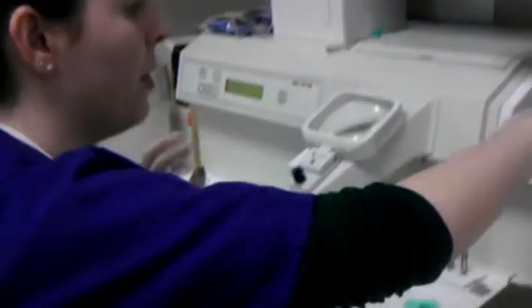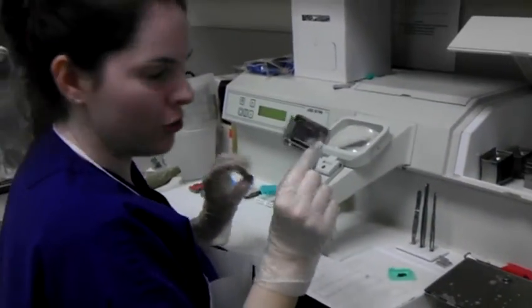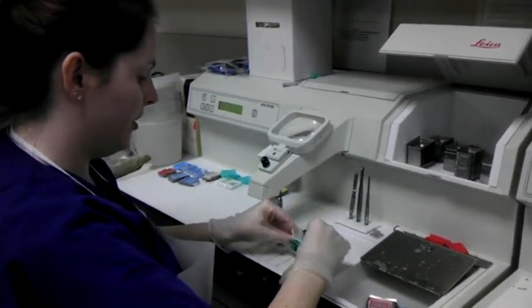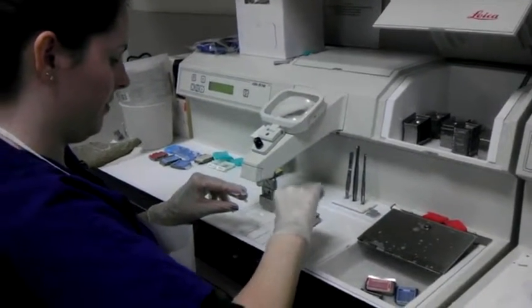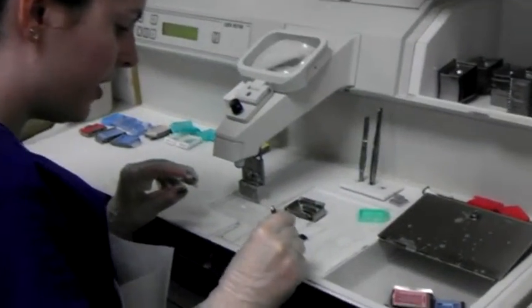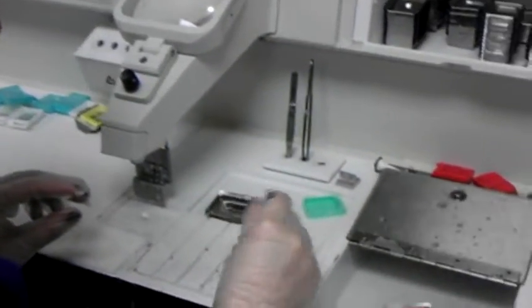Then you're going to pick out what molds would fit your tissue the best. Then you're going to empty your tissue out. You're going to kind of set it up how you want it — you always want to put the flattest side down.